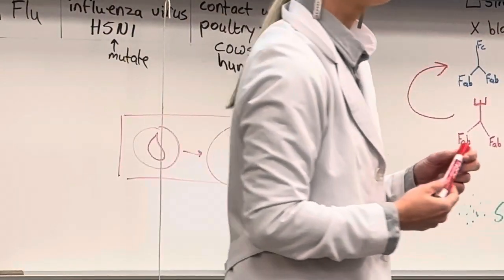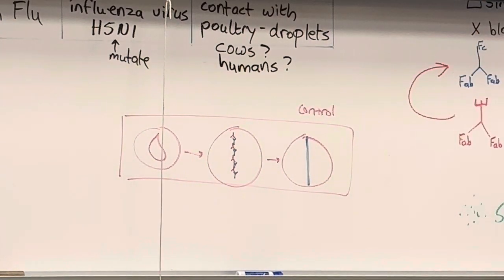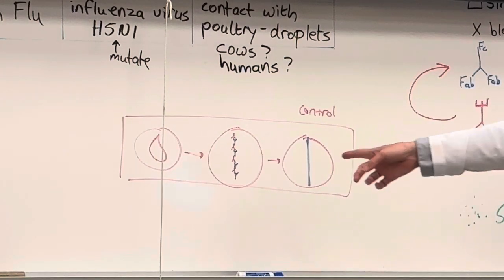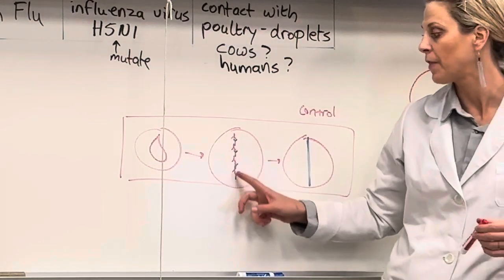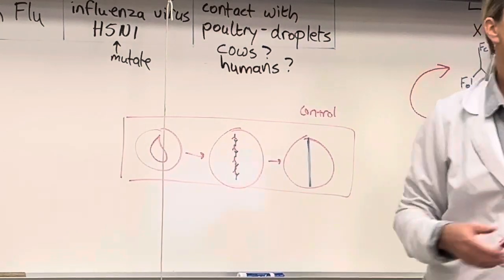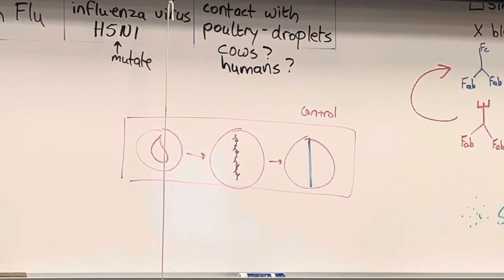Is it pregnancy testing then? Pregnancy test, you're testing for a hormone, human chorionic gonadotropin, a protein that will match and turn color. It works in the exact same way, but you're looking for a protein instead of an antibody to coronavirus.